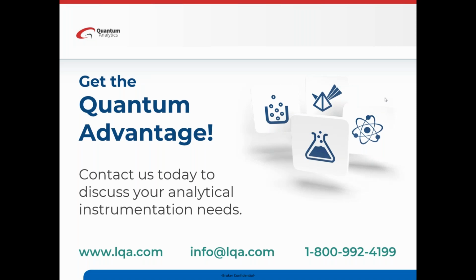But now it doesn't matter, because the systems are smart and they will pick up moisture. The Raman systems, it doesn't matter ever, but the IR systems, if you choose to have KBr optics, the software will tell you anyway. It'll tell you by that little button in the lower right-hand corner, it'll go yellow and tell you it's time to change your desiccant. So the system is smart. It takes care of itself.